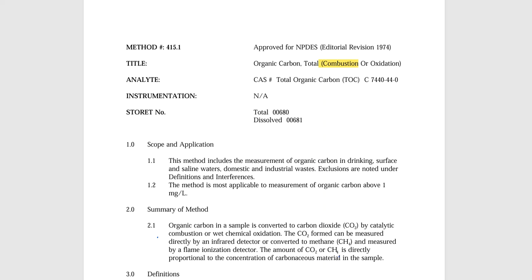Okay, everyone, welcome to this particular lab that we have chosen to showcase for you today. This is going to be total organic carbon, also known as TOC. All right, so as far as TOC goes, folks, there are a couple of different versions.